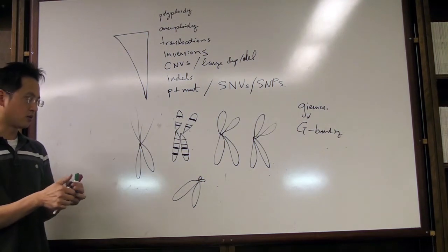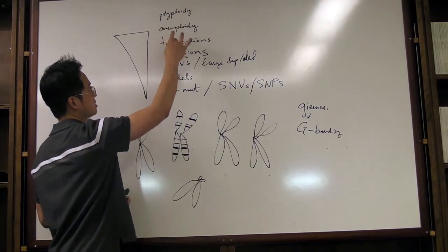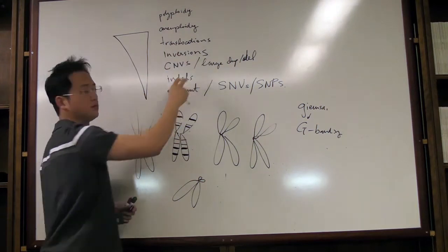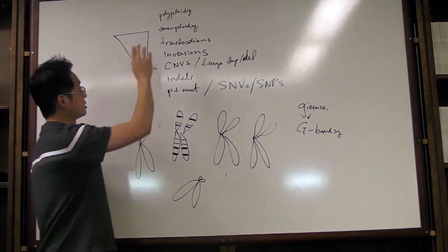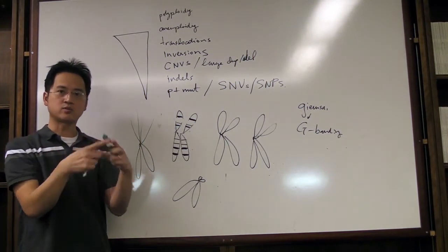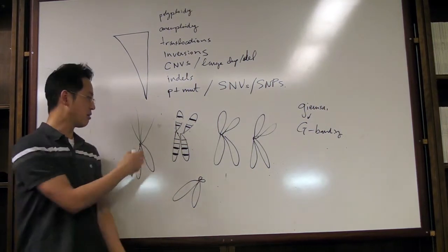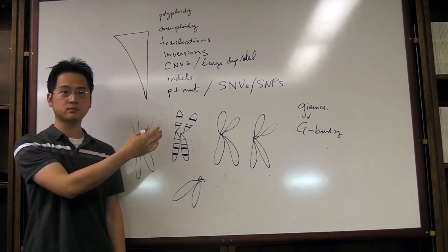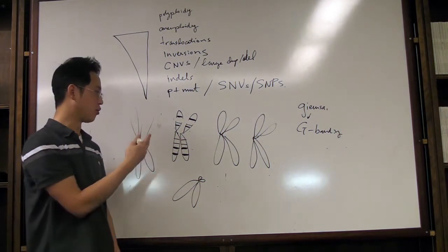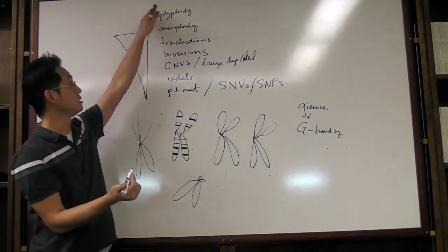So today I mentioned earlier about copy number detection, right? Which is basically what this is, what that is, and what this is right here. So polyploidy, aneuploidy, and CNVs are all copy number related. So let's do polyploidy. It's very easy for you to look at an individual cell that has been spread out via their chromosomal spread and metaphase spread, and just count how many chromosomes are there, right? So if you see 69, that's something that's completely abnormal, or if you see 46, that's something that's normal, or if you see 23 for some reason, you can easily detect polyploidy.